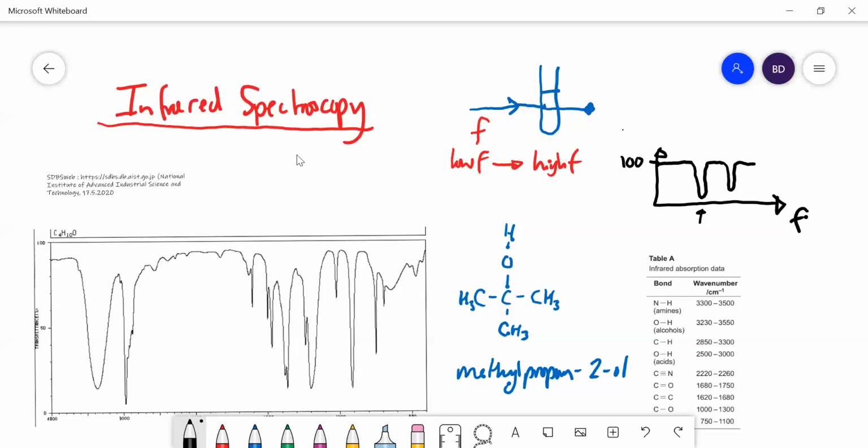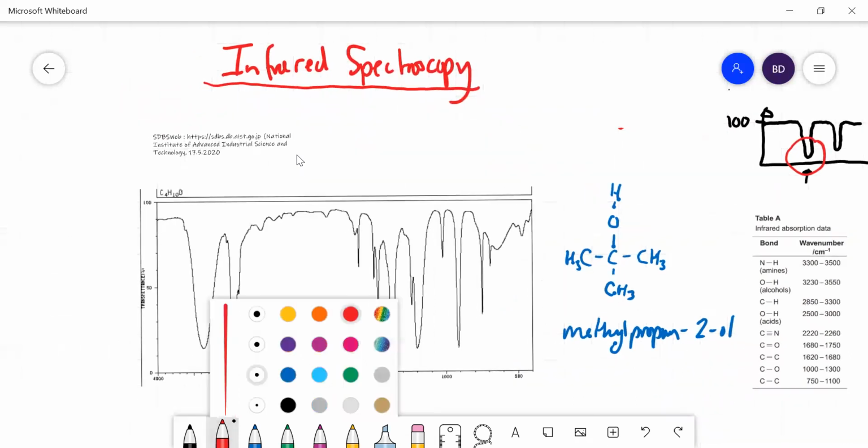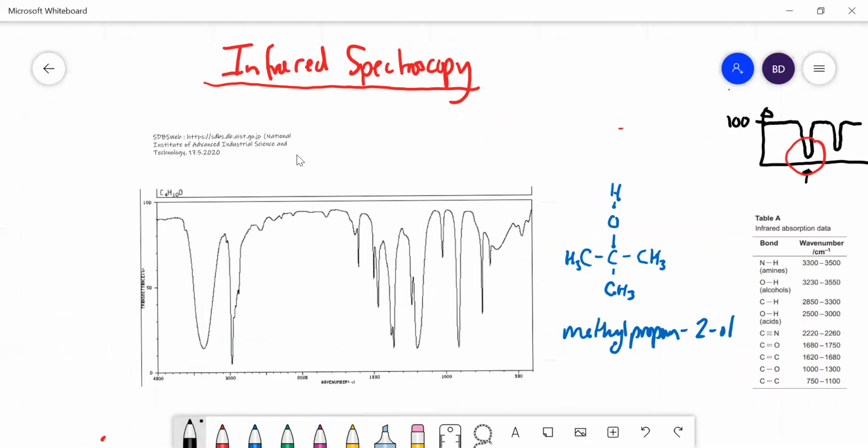There's a few little oddities about infrared. First of all, they call them peaks, but you can see they're not peaks at all. They're actually troughs, aren't they? And they say certain peaks correspond to certain functional groups. So let's have a look at a real spectrum instead of my little picture of it. You can see on this axis here, it actually says transmittance. And that's 100% there, that's 100. So that means all the light is going through, all of the infrared is going through.